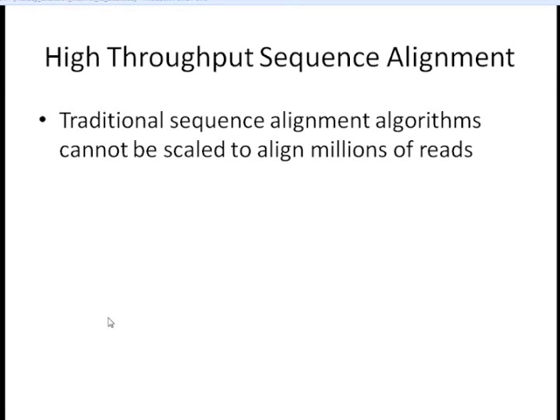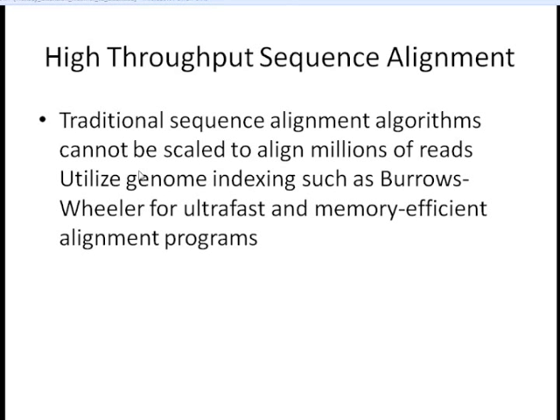Now that we have checked the quality of our reads, we can move on to aligning them. The traditional sequence alignment algorithms, particularly the ones discussed in the first part of this webinar, cannot be scaled to align millions of reads. They just weren't designed for that.